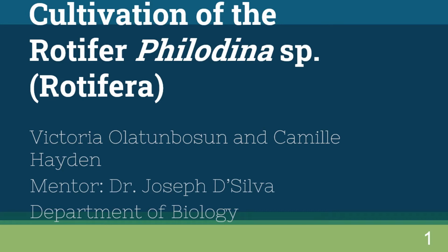Our topic of study was the cultivation of the Rotifer Philodina species using moss and water in the lab.